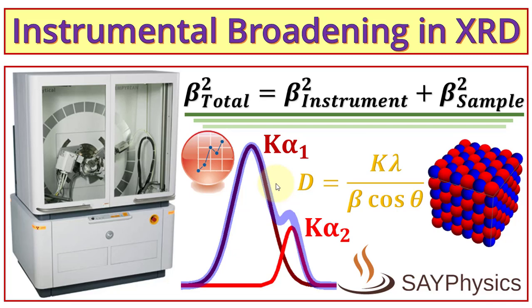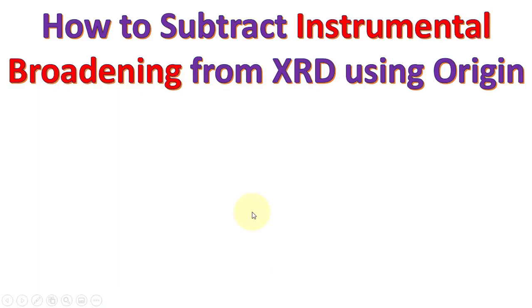In this video we will learn how to subtract instrumental broadening from XRD data using Origin.